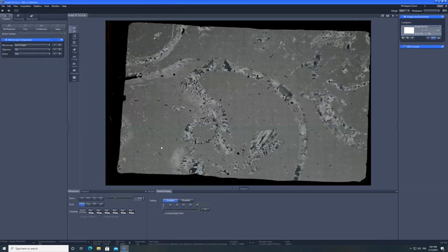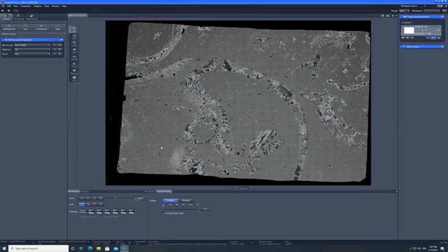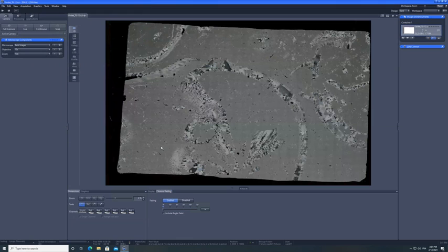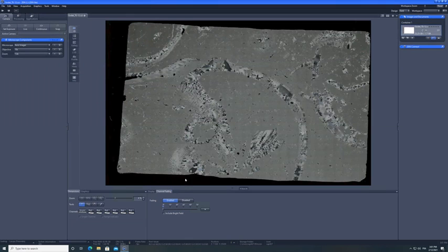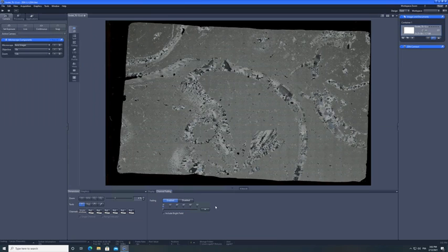Indeed it is. So this is how, this is what you should see when you open one of those CZI files. So it's an XPL view. And my colleague at Kansas State University and his students scan the whole thin section at different angle under XPL.